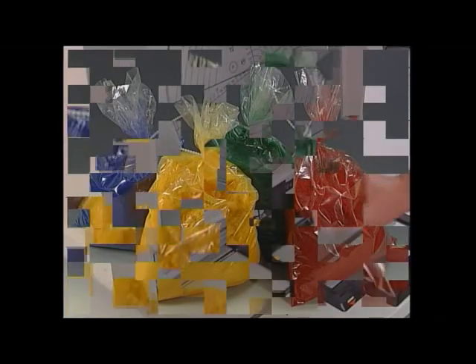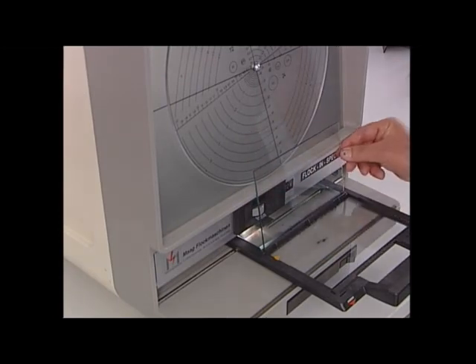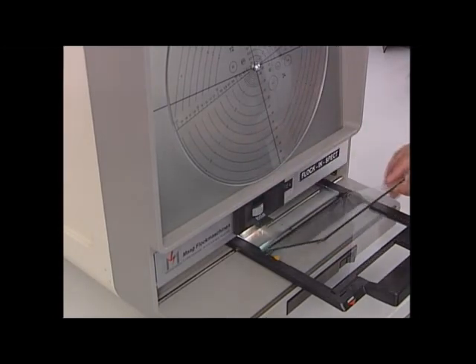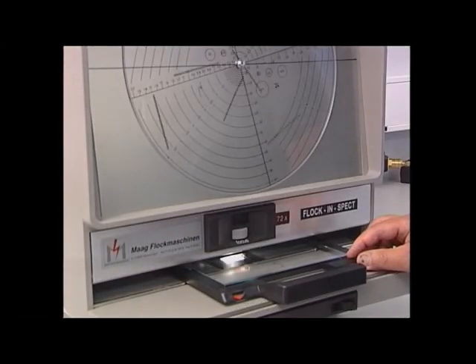Thanks to reliable testing methods which are in use worldwide, the current very high quality standard can be achieved. The Flock Inspect apparatus is used to check the geometrical form and the exact length of the Flock fibers.